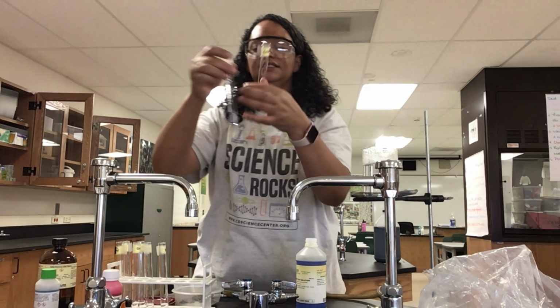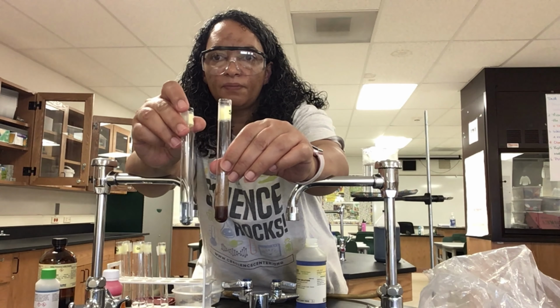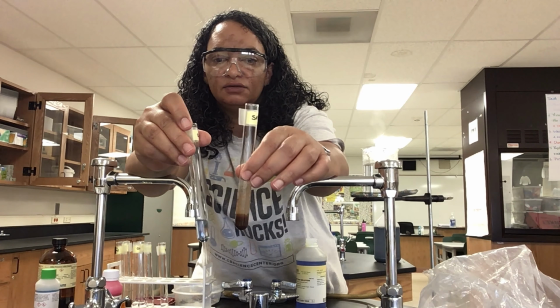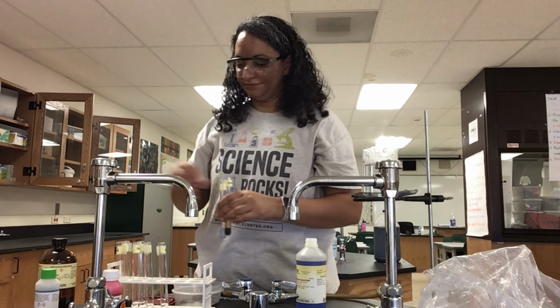But we definitely see a color change. So we have a definite color change. Got a lot murkier, a lot darker. So my control didn't really change color, but this one really, really changed. All right, so what does that mean? What does that mean about proteins? Let's talk about that.